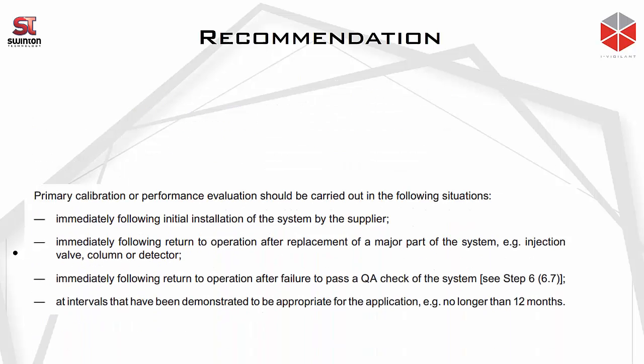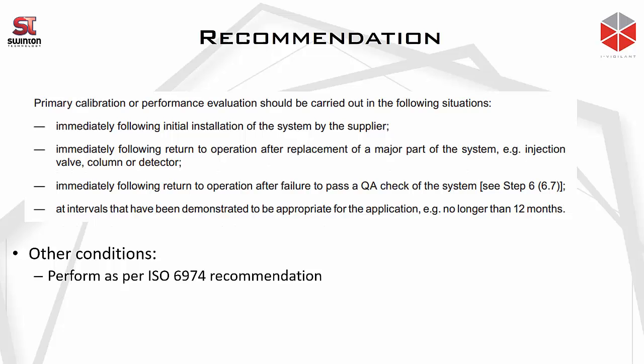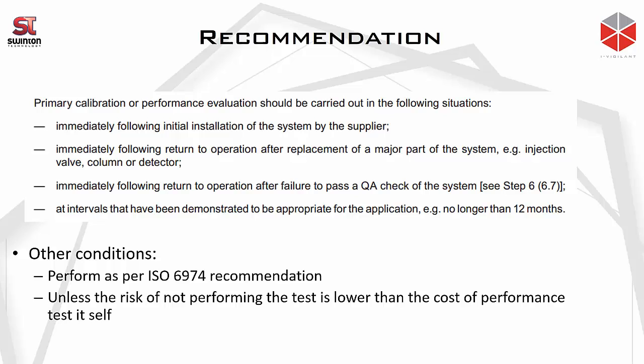So again, coming back to the recommendation, we need to do all that to be compliant to the ISO 10723. However, if the risk of not performing the task is lower than the cost of the performance test itself, meaning the risk of the bias is really negligible, then it's up to the end user whether to perform the ISO 10723 performance evaluation test. That concludes my presentation on GC Surgery Session 5 about multi-level calibration and ISO 10723.